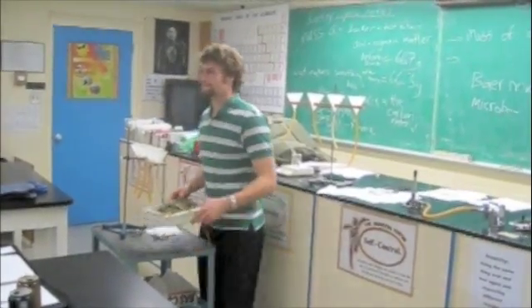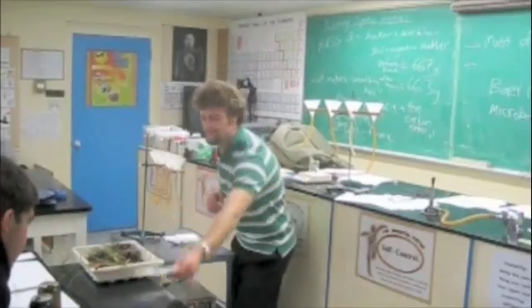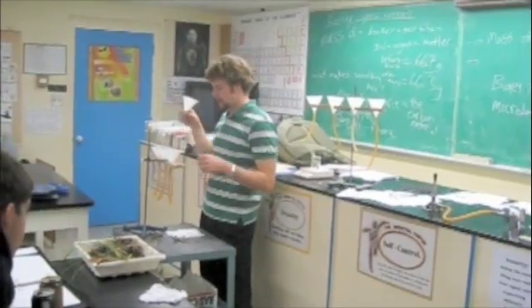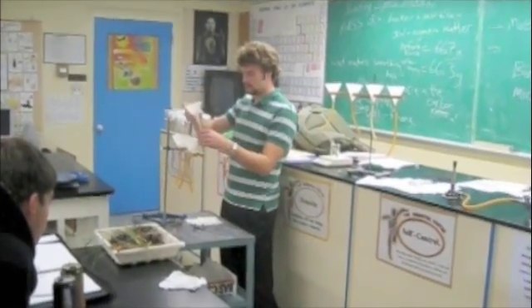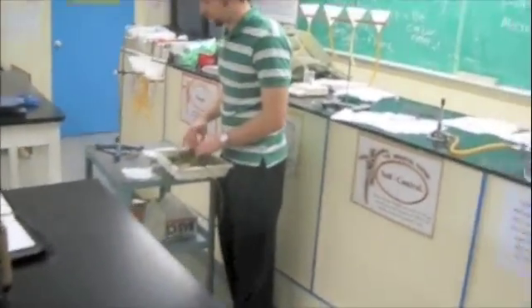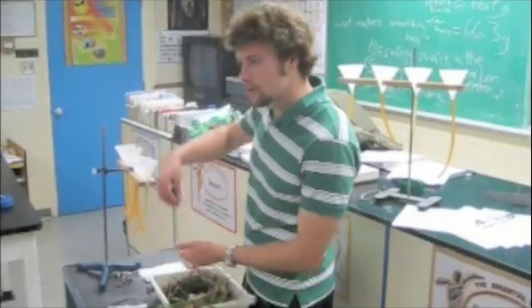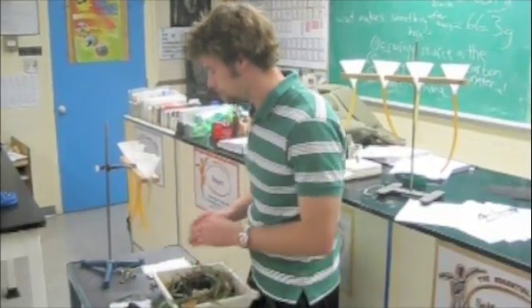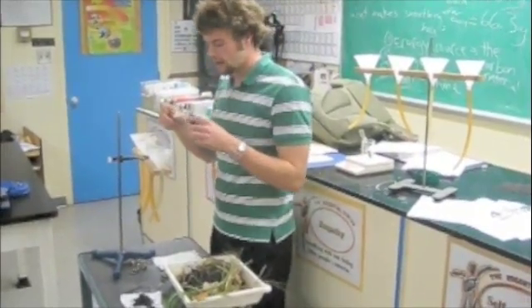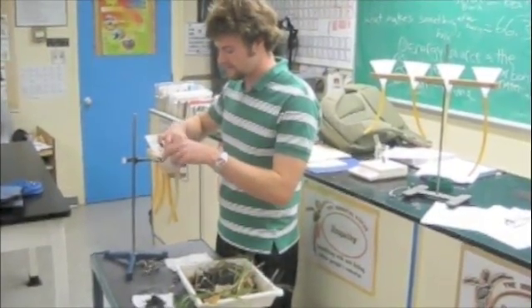So how do you do it? Make sure you know how to do this. I have cheesecloth — or gauze. I've got just a simple funnel with a tube connected to it, and here's a ring stand with four little holes where I can put these. I also have this grating — I'm not entirely sure how much we need it, because maybe this cheesecloth is going to be okay. But I'm going to put that in there just to prevent soil from getting through this tube.